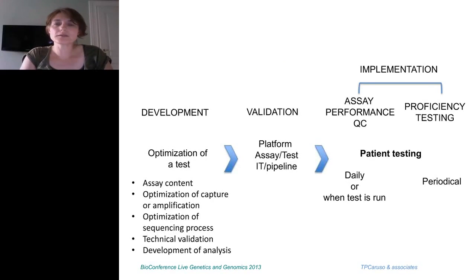Now, when you think about the whole process, developing the new assay is a critical question here. You have a number of possibilities, and depending, first of all, where you are located geographically, whether you are in the US or in other countries, in Europe or in Australia, there will be different regulations as to what can be used.